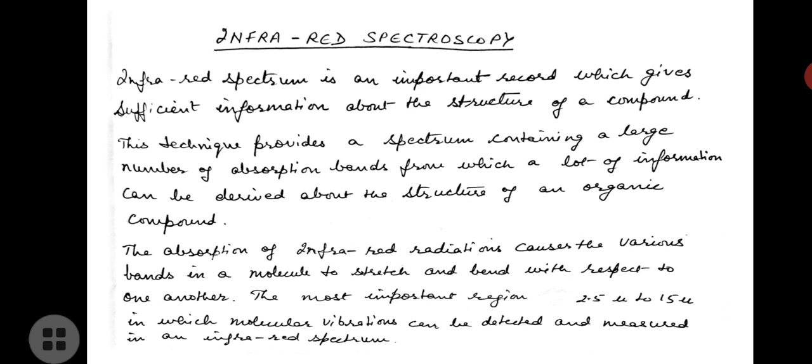The presence or the absence of absorption bands helps in predicting the presence of certain functional groups in the compound. IR spectroscopy technique is quite useful for studying chemical reactions.